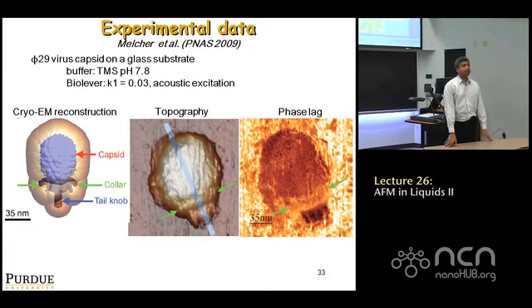It's not that you have a chamber in your AFM. All liquid AFM we're talking about is physiological conditions, ambient temperature.